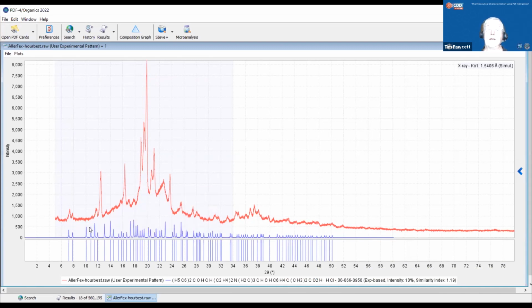Now, the reason why I'd say I'd never analyze it, I'd want to do the complete analysis first. These peaks here are a cluster of alpha lactose monohydrate. We have broad profiles here, which are going to turn out to be cellulose. I know this because I did all 65 of those drugs, and I know what those patterns look like. And then if you analyze the alpha lactose monohydrate and you look at the cellulose, you'll see that the peaks you haven't identified tend to be these peaks that all belong to this particular polymorph. But you can take a quick look right away by doing that type of search that I just did.